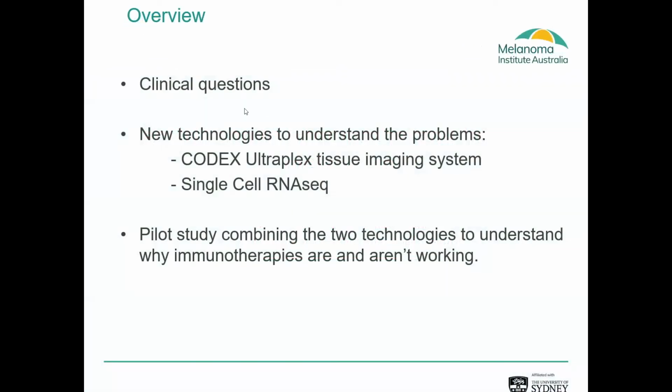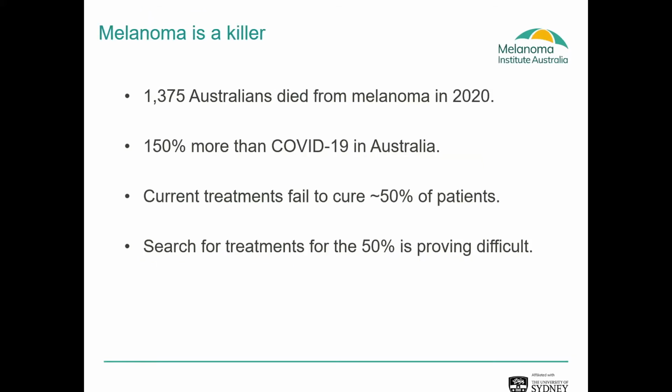So just an overview, I'd like to raise some of the clinical questions that we think we can answer with these type of technologies. And the two technologies we're trying to combine are the CODEX system that you've been seeing today, and single-cell RNA-seq data on the same sample, to bring the two technologies together. We think it's going to be a really powerful tool to understand the tumour microenvironment. And we're aiming to use these tools to understand why patients might or might not be responding to immunotherapies.